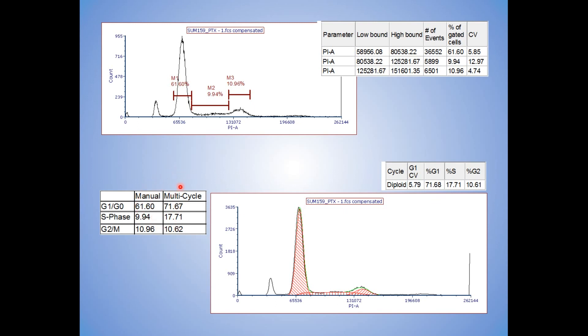Here's manual, the region, multicycle through the software. And you can see some marked differences in the G1, G0, and S. I have also seen differences in the G2M as well. But the differences here are remarkable. And if you're looking at a large number of samples looking for a subtle difference, you're not going to get there with this.